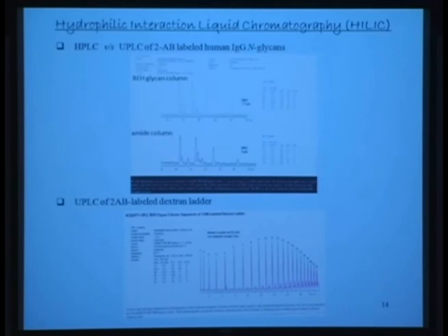And there is a certain range in which you use it, you get a linear flow rate, and everything else really works well. The pressures here could be somewhere in the region of 2,000 to 5,000 psi. The pressures here are typically 15,000 psi. So in combination of really fine particles and very high pressure, you have phenomenally increased resolution.